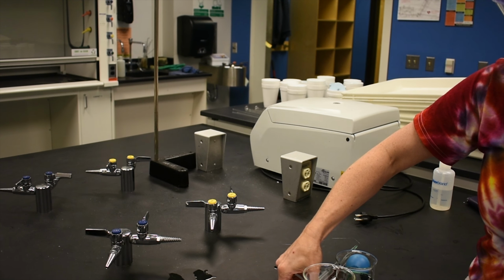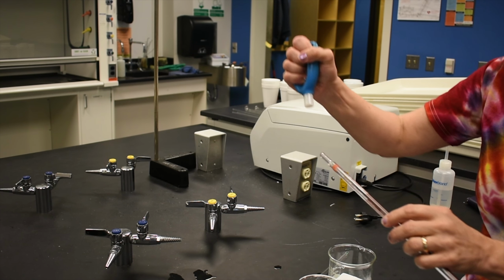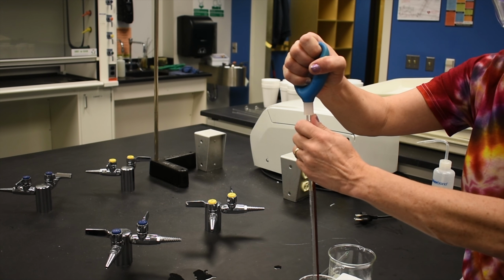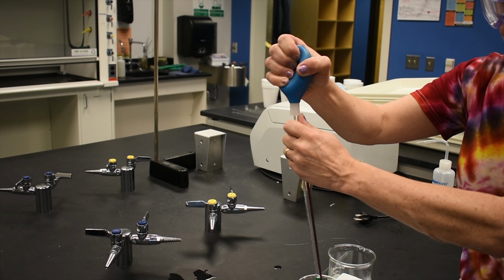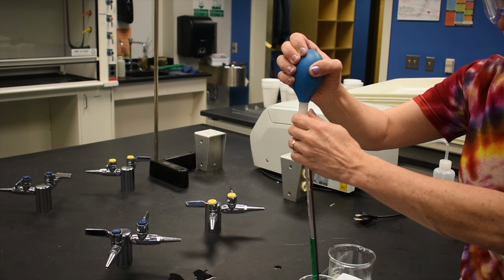All right, in order to use pipettes, you will need a pipette bulb. Pipette bulbs look like this, and we'll start with the graduated pipette. You are going to get your solution, depress the bulb so that the air is squeezed out, place your pipette in your solution, put the bulb on top of your pipette, and then gradually release your hand so that air goes into the pipette bulb, and you'll see as this happens, the solution slowly rises up into the pipette.